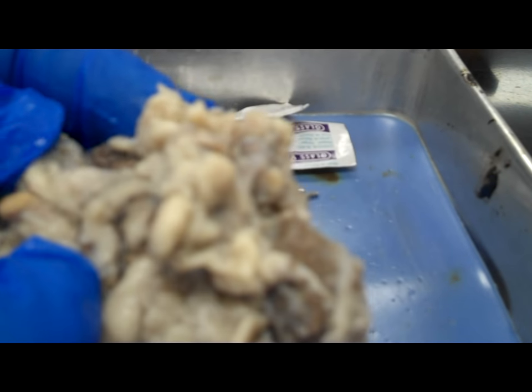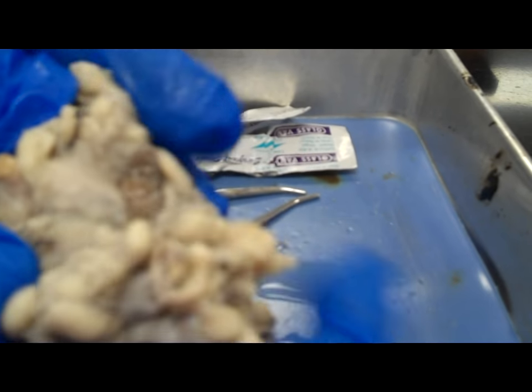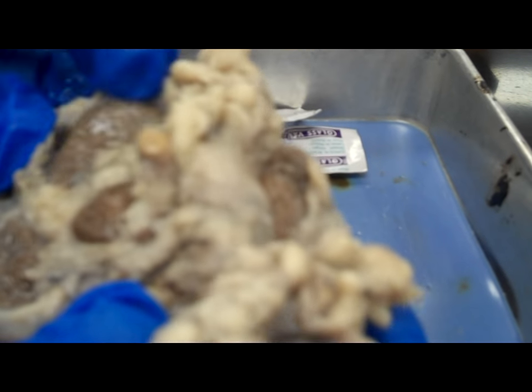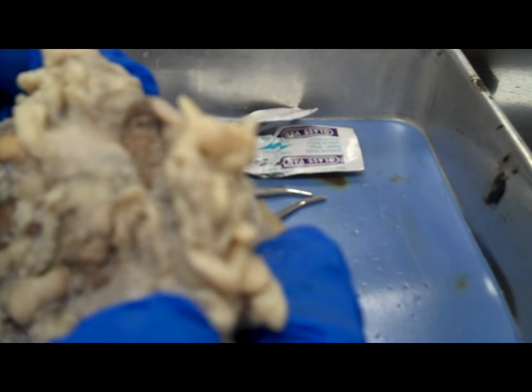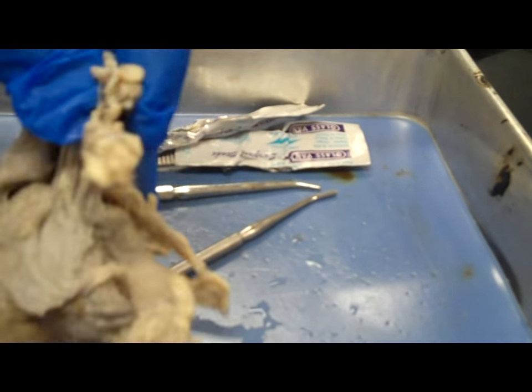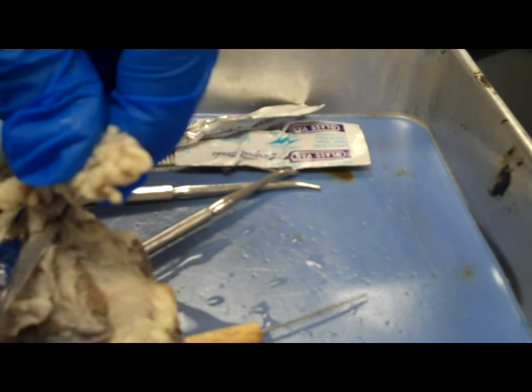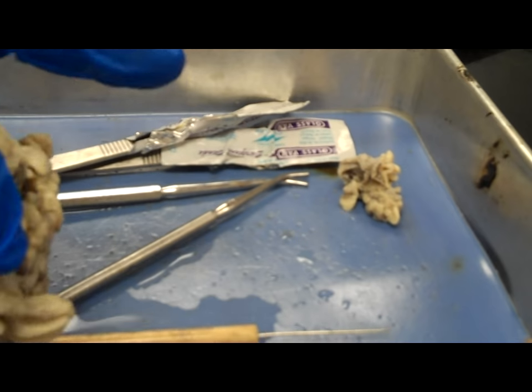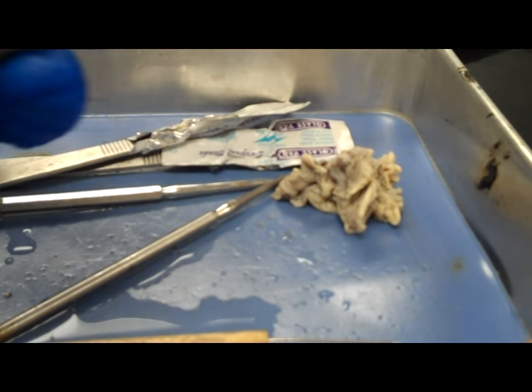Just kind of looking over it and seeing what I can see. I think I have found the optic nerve at this point in the video — that's the little piece I'm pointing to. But if you look around the eye, there's a lot of fat and a lot of muscle attached to the eye. I'm going to quickly speed this up.